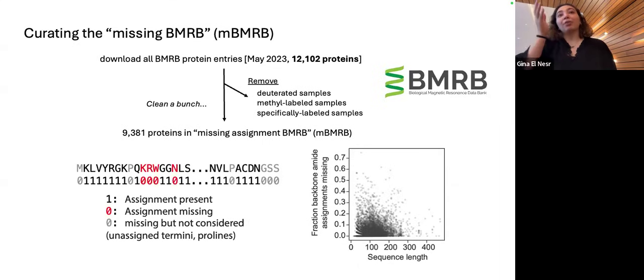I don't know whether taking those chemical shifts and plotting them would say these are too much, because people spend a lot of time labelling with carbon and running multiple different field strengths and experiments to do their best to assign it if it's something new. So yeah, it's an assumption, and hopefully the proof is in the pudding, as we like to say.